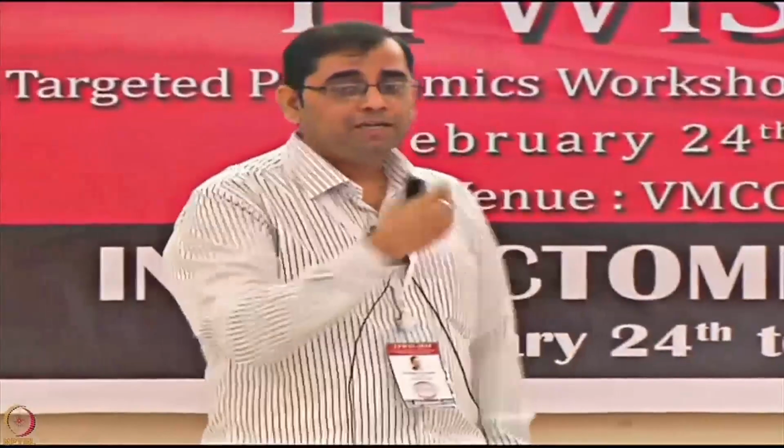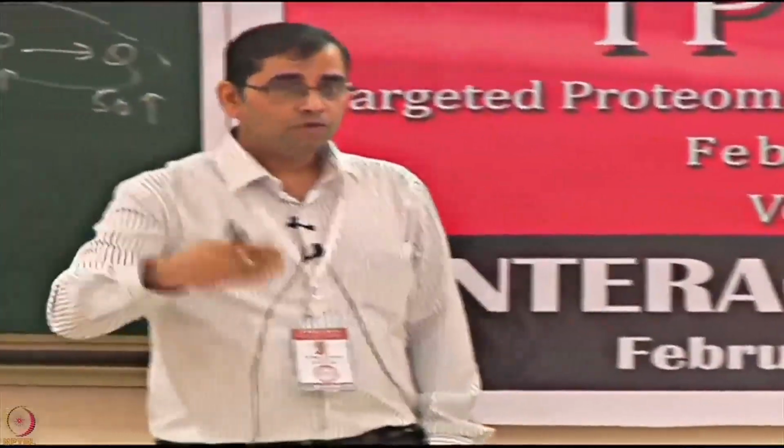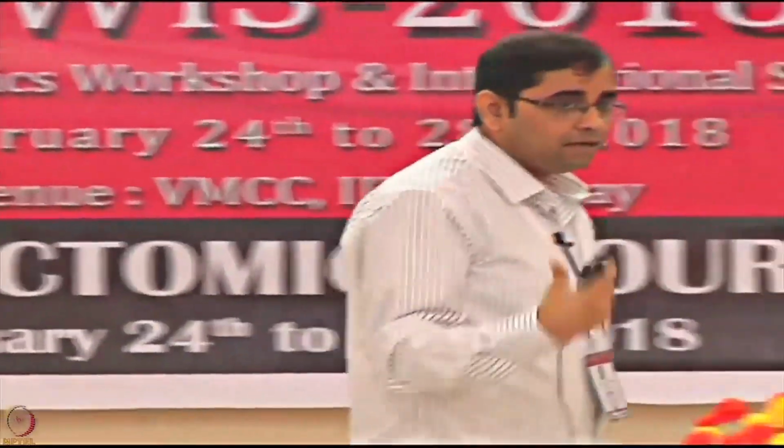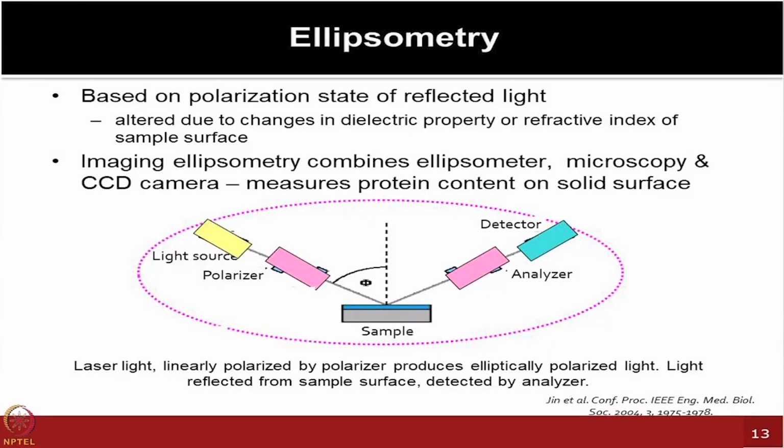Just immediately after these papers were published, a lot of applications started emerging out of them. It's a simple concept: you are measuring antibody-antigen interactions, looking at the conductance change, and if that can give you some idea that some individuals are carrying antigens which are going to give rise to a certain viral disease, then probably you can do much more specific tests on those.